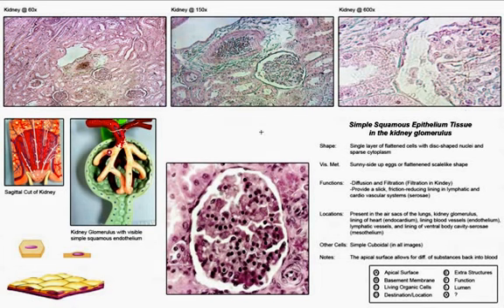Okay, this is the kidney slide. What we're looking at in this picture here and in this picture right here is a larger view, 60x view of one of the medullas, medullary region, the medullary pyramid in the kidney. This outer region here is the cortical region where the majority of the glomeruli are found, and this is a low magnification view of each of those glomeruli in that cortical region out here on the outer edge with a number of different kidney tubules, cuboidal lined kidney tubules surrounding it.